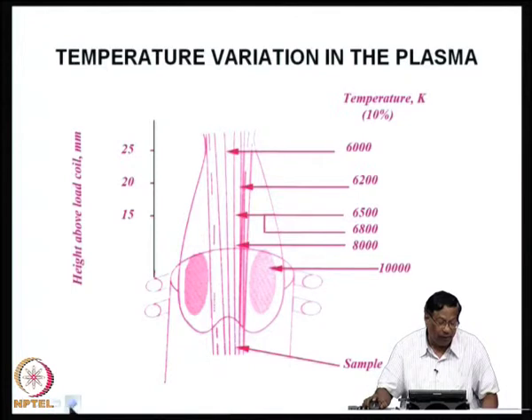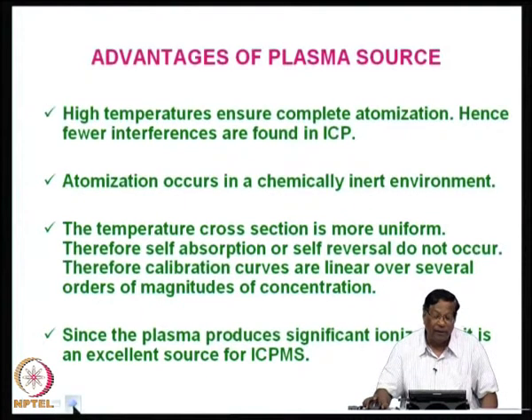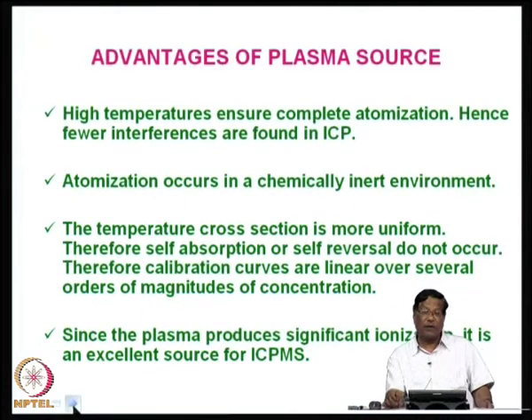That means the emission characteristics will remain constant with respect to temperature, because at higher temperature you would still be able to get the different spectrum and atomization efficiency will be more, but for normal routine analysis what we need is a constant output, and this constant output is ensured by the constant temperature.